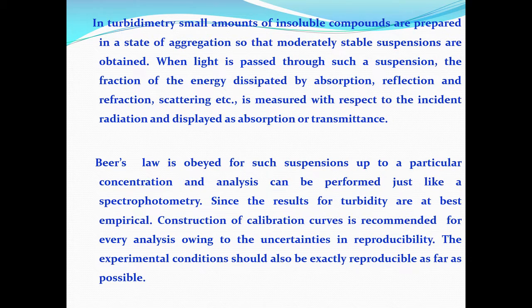So, we strongly recommend that every time you make a measurement, check the calibration first and adjust it accordingly for small experimental variations, because 99% of the time it is only an empirical correlation.